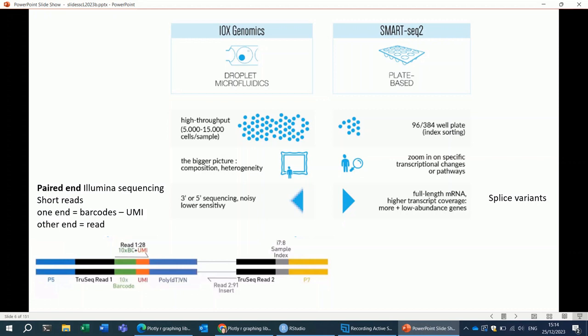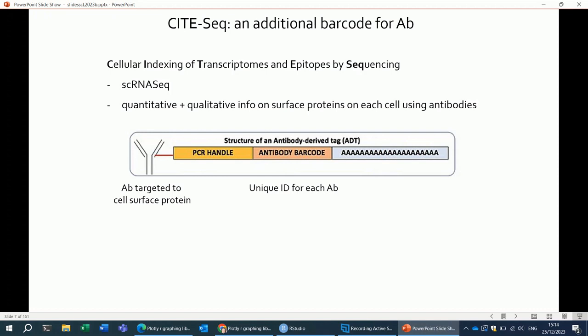To reduce sequencing costs and to avoid introducing noise in the data, samples can be sequenced in the same lane of the flow cell. This is only possible when there is a way to find out for every sequence that is generated which sample it came from. And this is where the antibodies come in.